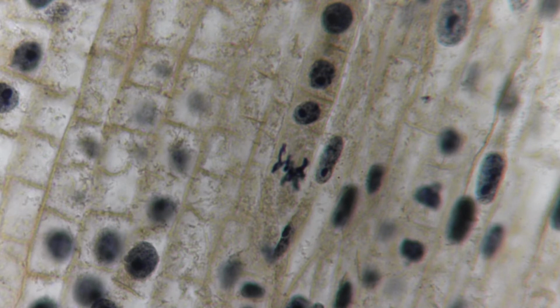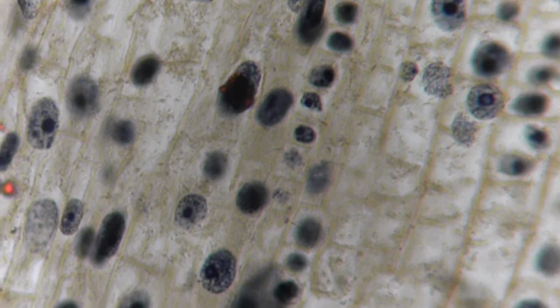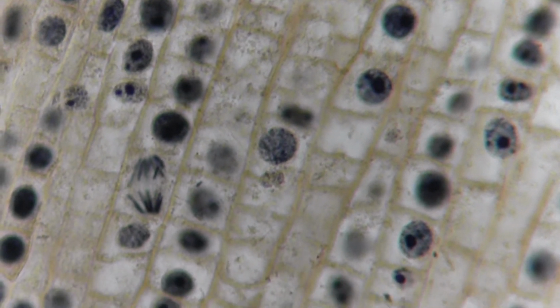So that is metaphase, where the chromosomes have met. And you label cell wall, the dark purple thing's chromosomes, draw in the spindle figures going to a point above and below, and then that pink grainy stuff outside is the cytoplasm. And I'm going to anaphase. It's a pretty good one, and it's going to be to the right and down. So let me see if I can find it like I did earlier. I'm going to go to the right and then go down. Okay, here it's coming. Let me get it to the center here.